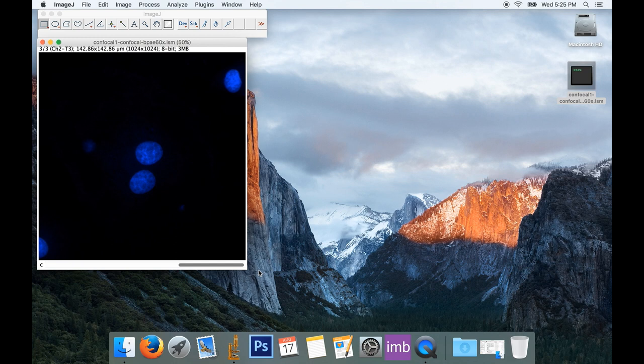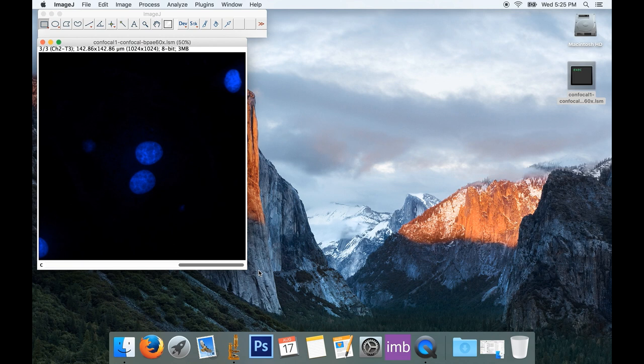Ideally, I'd like to be able to see all of that information overlaying on top of each other so I can see what the relationships are. So in order to do that, I'm going to need to split this image into the three constituent images that make it up.